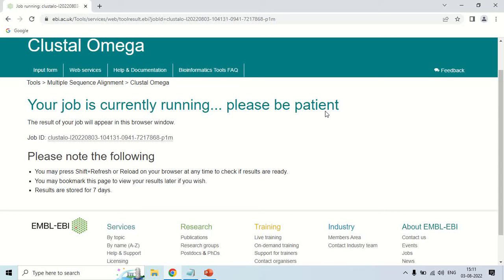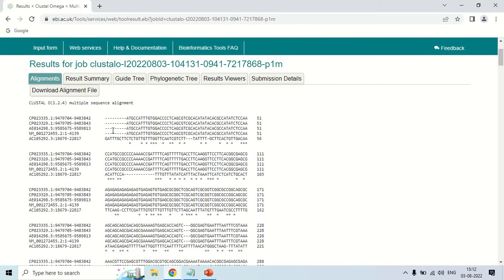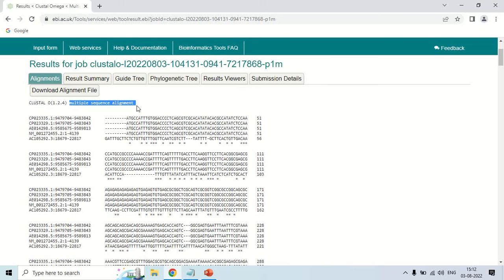The time taken generally depends on how many sequences you are using for the multiple sequence alignment and how long they are. Now you can see that the results are in front of us — this is the multiple sequence alignment performed by Clustal Omega. There are certain options here: the first option is 'Alignment,' which is already clicked, and it is now showing the alignment.